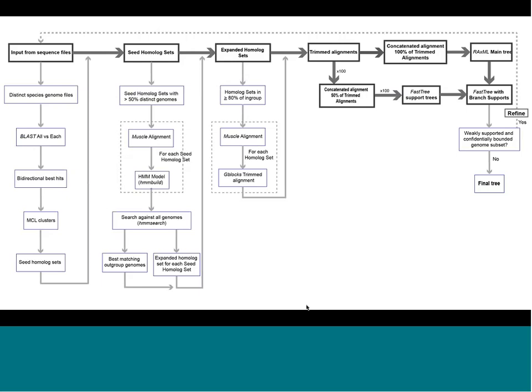So I don't want to go into all of the components of it, but I want you to pay special attention to this specific part of the pipeline, way over there on the right side in the middle of the page. After you get a fast tree, you can refine it. There's a box there that says refine. Now, the tree building algorithm in PATRIC has something special called progressive refinement that I'm going to talk about now.